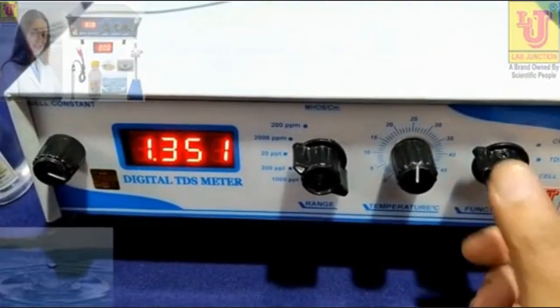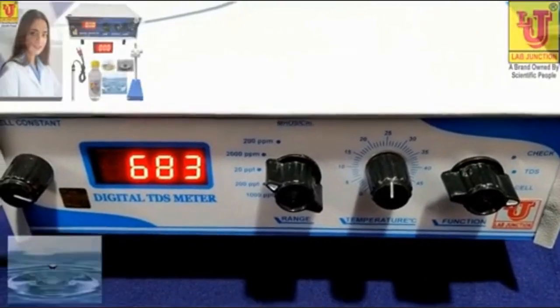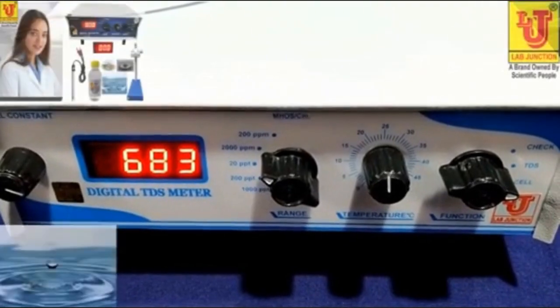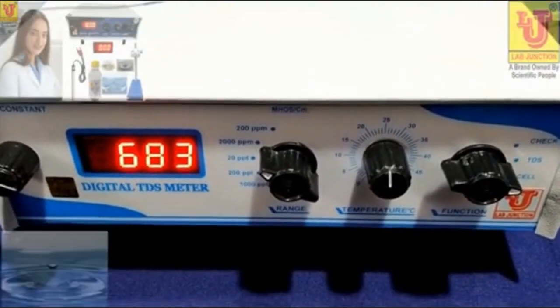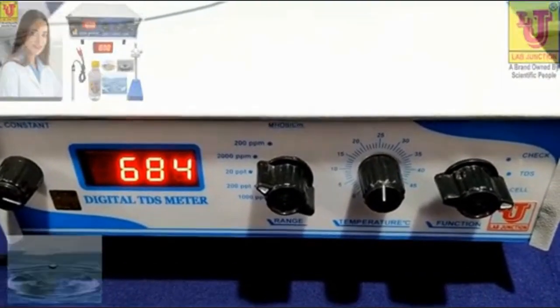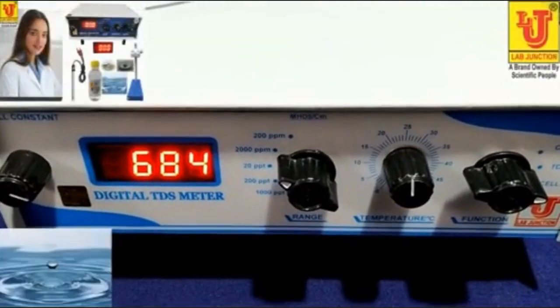Like this, and directly go to TDS control and take your readings of samples and note down in your notebook. This is the final testing procedure of digital TDS meter. Thanks.